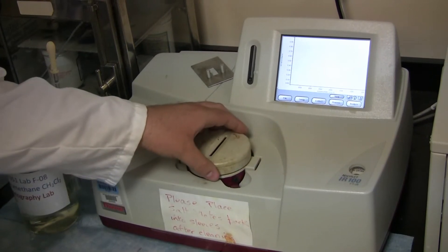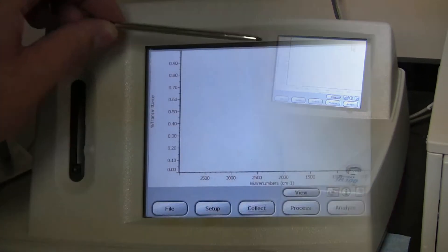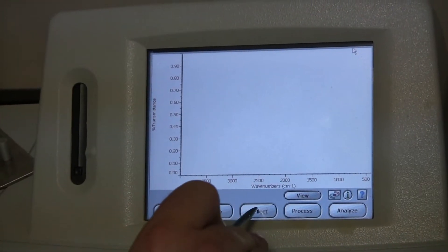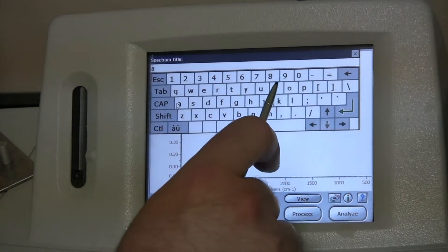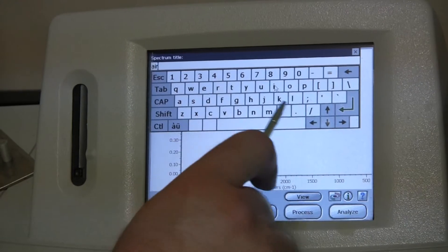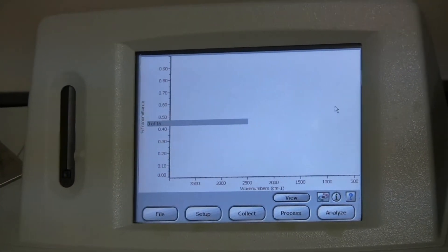Start off with nothing in the machine, and just place the cap on. Start off by going to Collect, and then Background, and then type a name. Click OK, and wait for the scans.